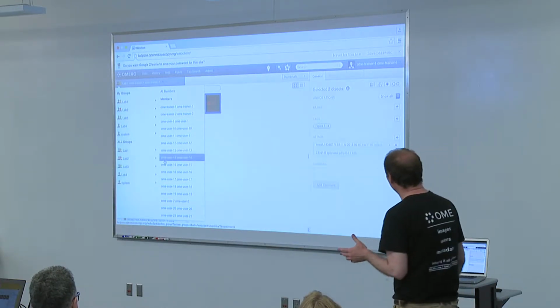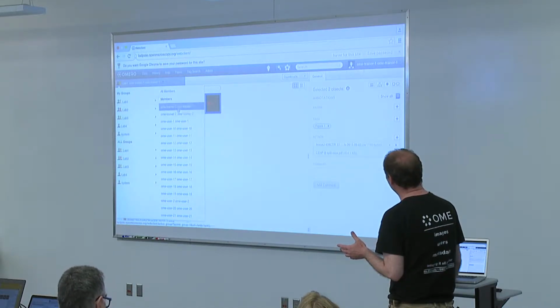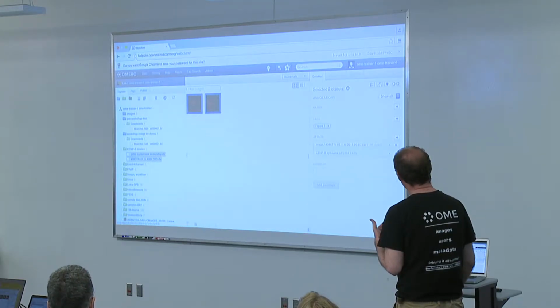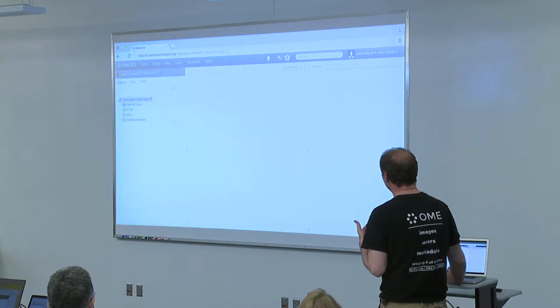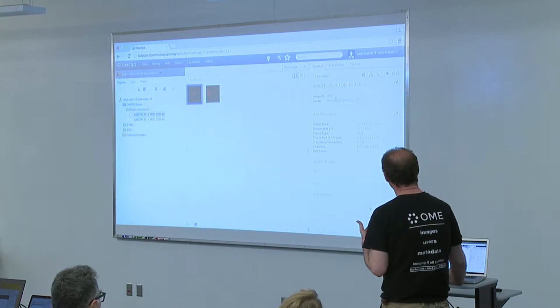So everybody can go there and just click on the OME trainer here. Just make sure that you're on the Lab 1 OME trainer, and you will see much more data. This will be my data. And every time when you are not sure whose data it is, you can check it just over here. Select just one image, and you can see that the owner is OME trainer 1. This is me. And of course, just to demonstrate what I was saying, I can go to OME user 10. These are not my data anymore. This is his data. You can see the proof here. This belongs to OME user 10.